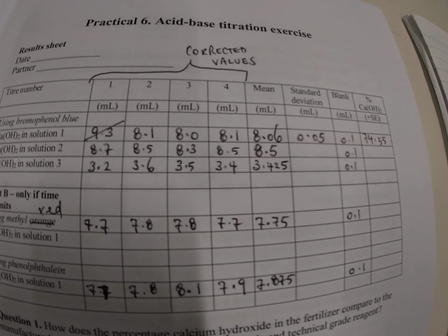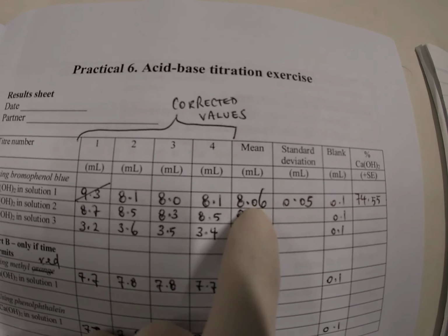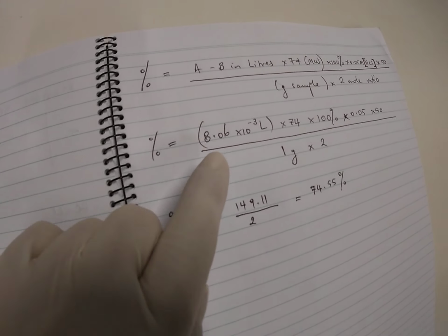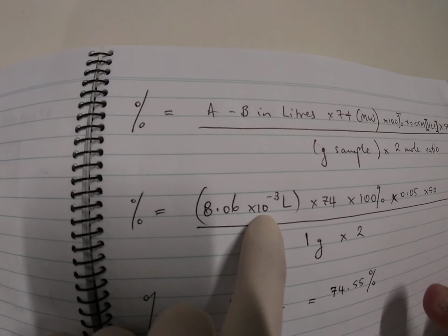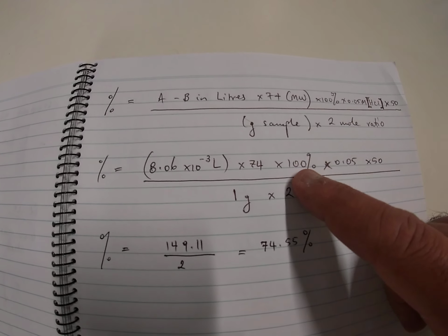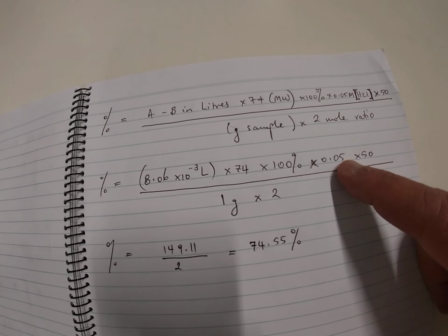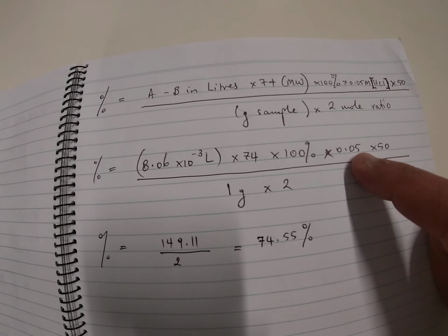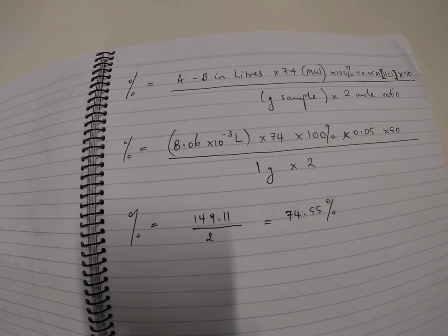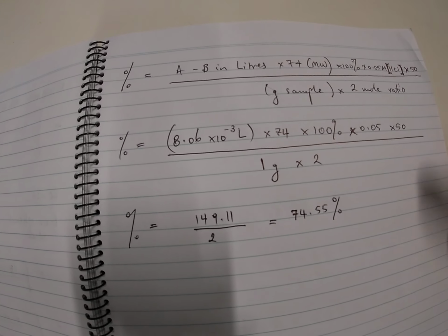So we're just using the mean here for solution 1, 8.06, and there it is. And there's the conversion to litres. Times 74, which is our molecular weight, times 100%, because we're looking for an overall percentage, times 0.05, which is the molarity of hydrochloric acid, times 50, divided by 1 gram, because we only looked at 1 gram of calcium hydroxide in that solution, times 2, which is our mole ratio.